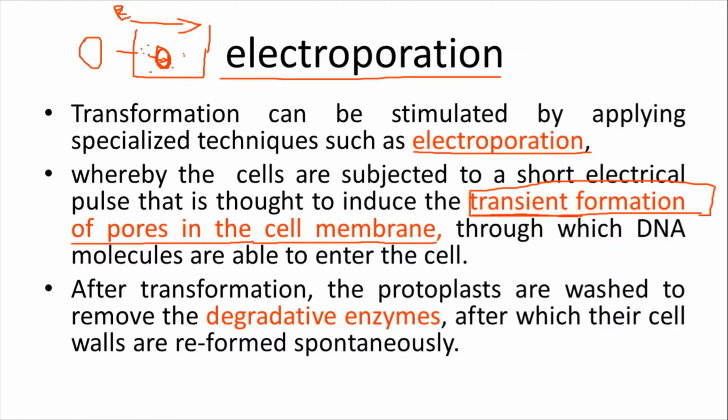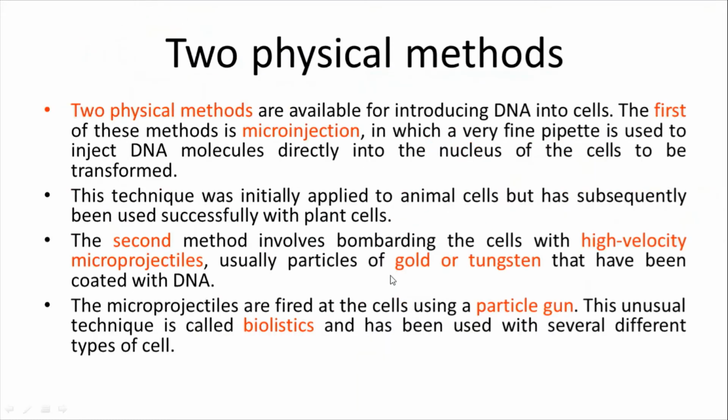So apart from electroporation, two methods are there. One is microinjection. The next one is called biolistics. Biolistics is otherwise called the gene gun method, or particle gun, or sometimes particle bombardment. All the terminology is the same: biolistics, particle gun, gene gun, particle bombardment, everything is the same.